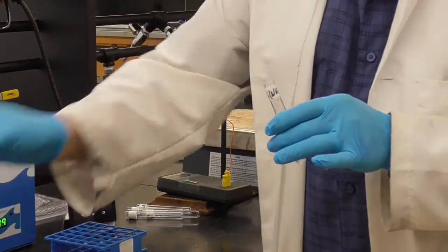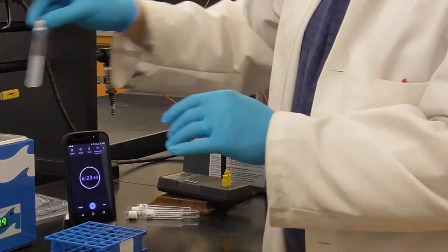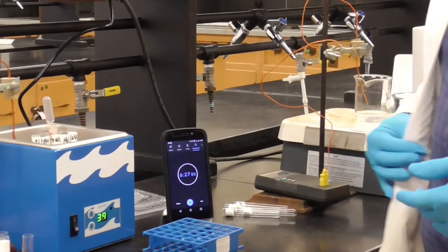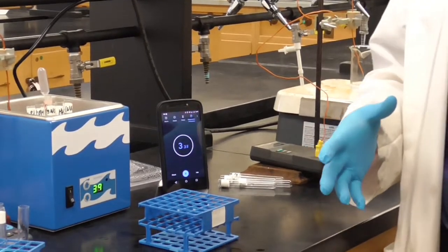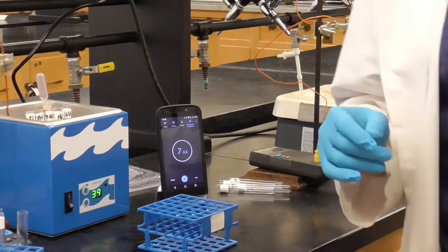All right, so now we have our 5 test tubes all at 37 degrees here, and the only difference between them is what possible inhibitor we have added. So we'll go ahead and stop this, reset it, and we'll give them 15 minutes for the enzyme to possibly work, and then we'll test it. Which means first we need to get our test plate ready with the iodine drops.